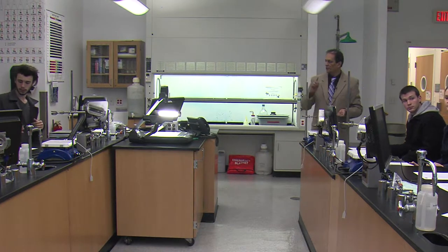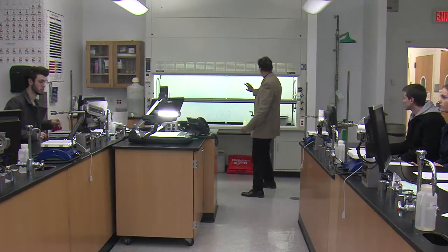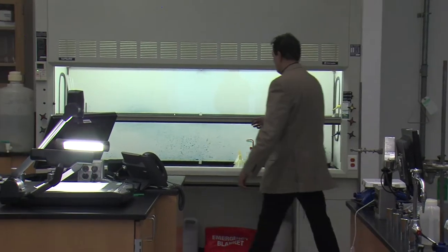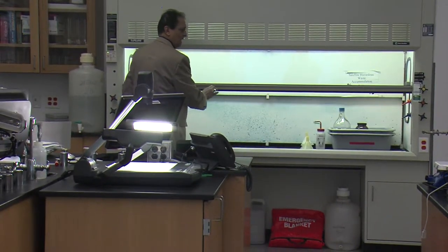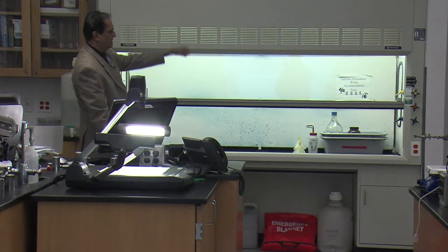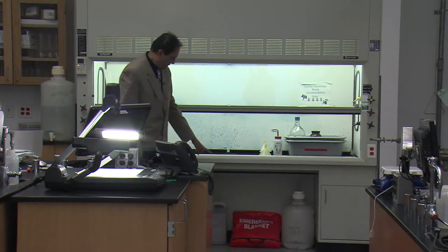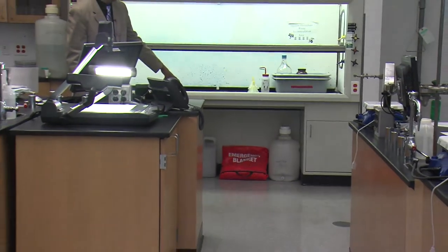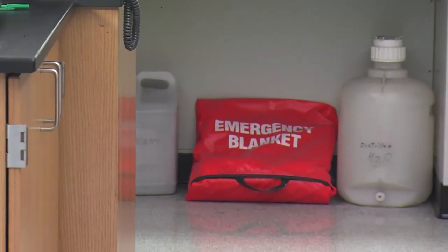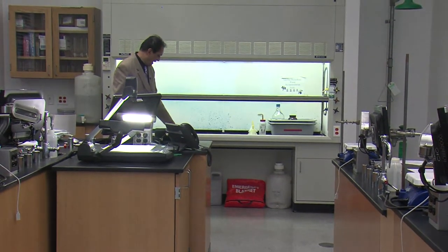Now, as you are doing this, I will show you a few safety features that are present in the lab. All right? The first safety feature is the fume hoods. Anything that generates fumes, you will have to perform under these fume hoods. This thing is called the sash, and this sash can slide up and down. When you slide it down, there is a fan that takes the fumes from here and throws it up on the roof. The second safety feature is the emergency blanket over here. And there is spill absorbent. So if something spills on the floor, we will put this on and we will collect it with the duster and the dusting pan and dispose of it appropriately.